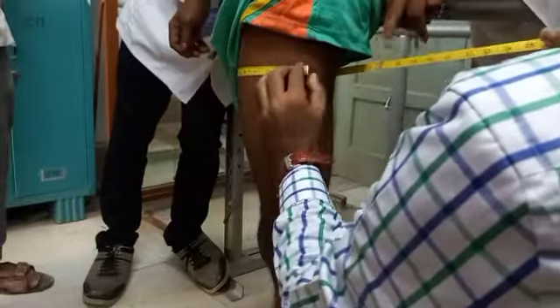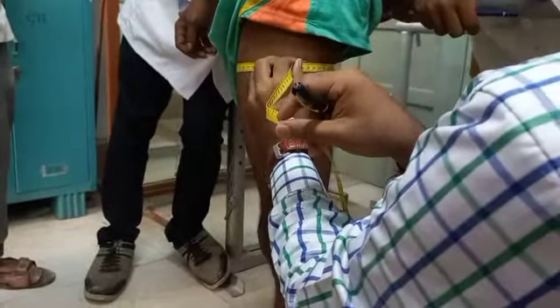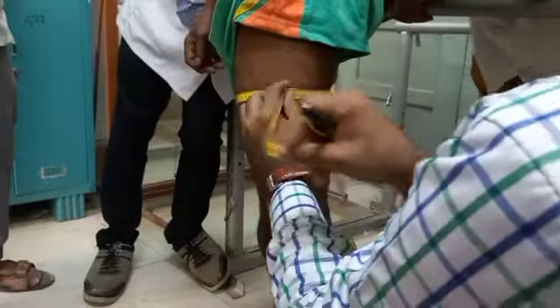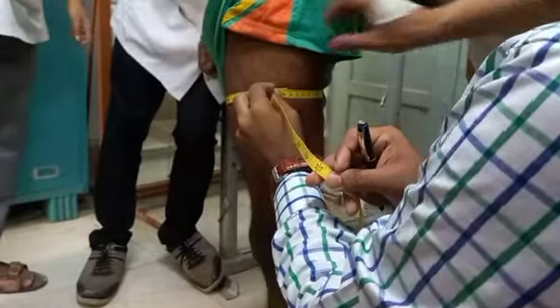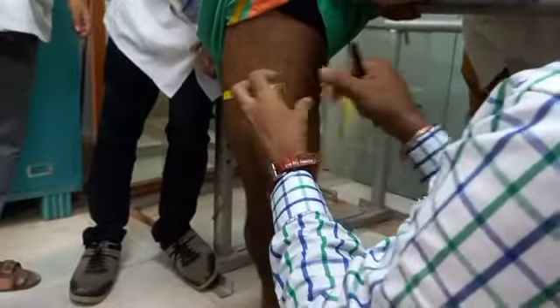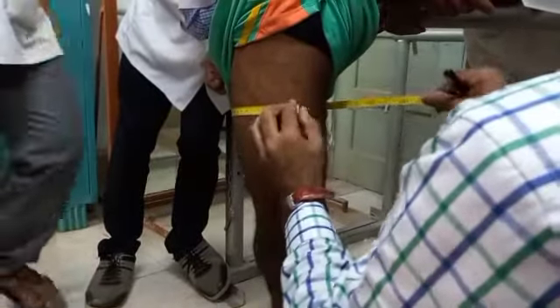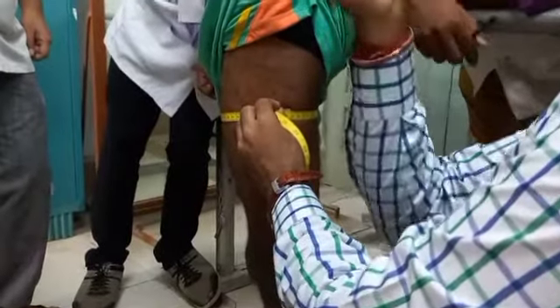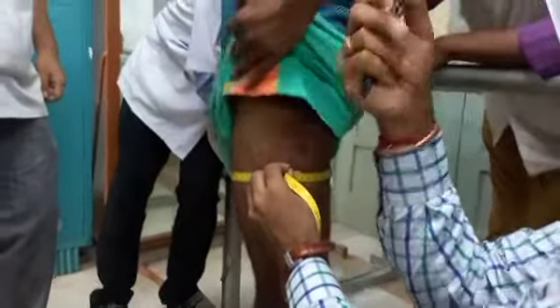Okay, first take the measurement, then we will be discussing. Okay, measurement done? Yes, it's done. Let's see again, 45. Measurement change or not? 45 I said now. Change, na? Yes, this is something you will find, that just because you are loading a method or something, you have to come up with at least 2 measurements, and then you have to try to take the mean average.